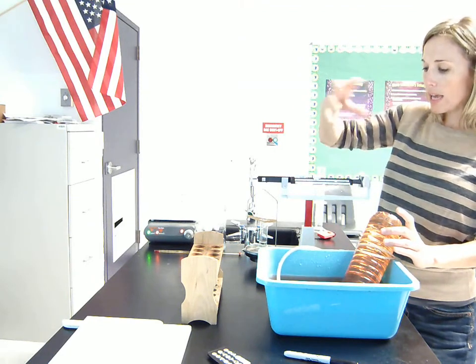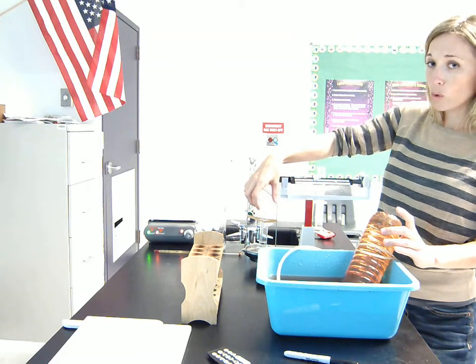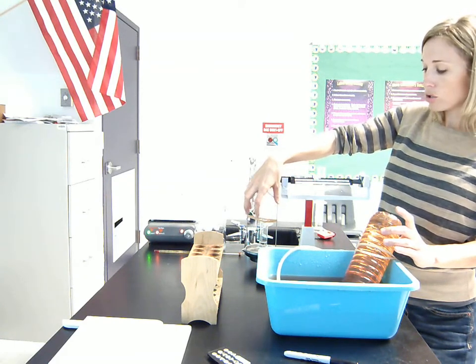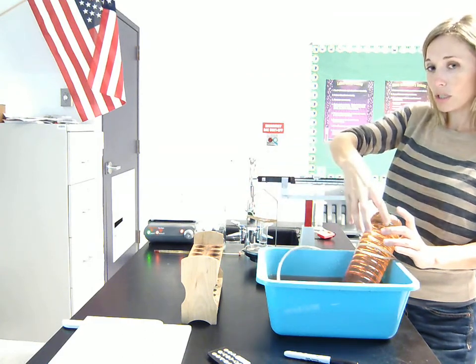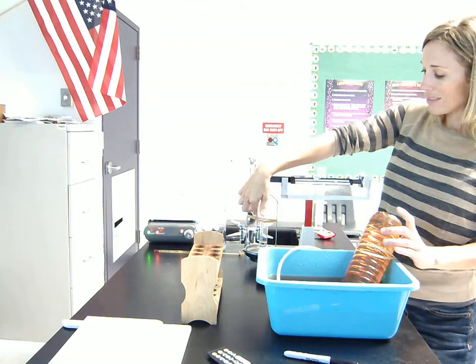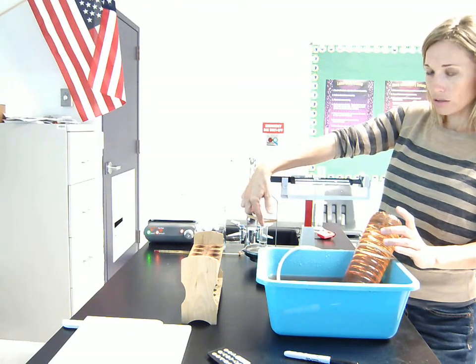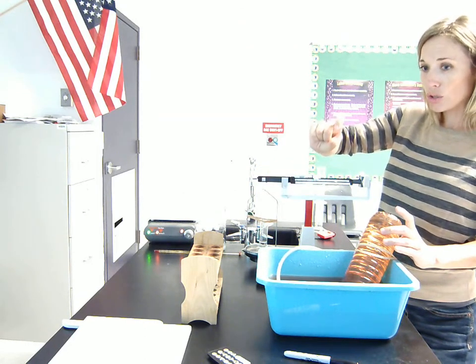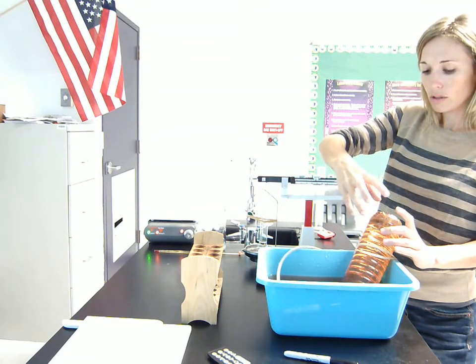So again, we know that what we're starting with, the Alka-Seltzer and the water, that mass won't change, even during the chemical reaction between the Alka-Seltzer and the water. So that's going to react, and then we're purposely going to take the gas that it produces and put it here. So in the end, when we mass the test tube with the water and the leftover Alka-Seltzer, we're going to notice the mass goes down a little bit, and it's going to go down by exactly how much gas we moved over to this bottle.